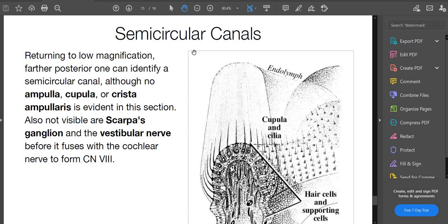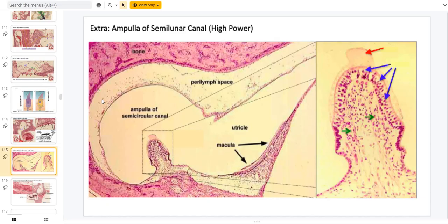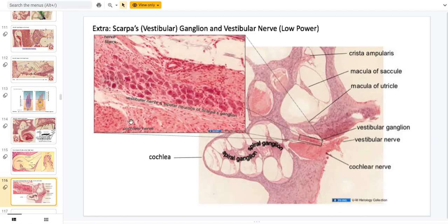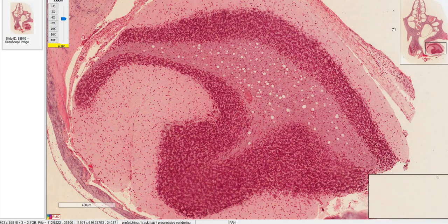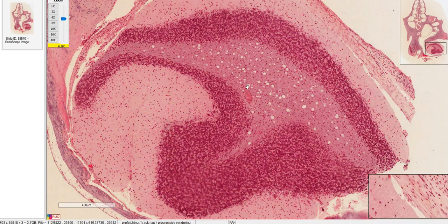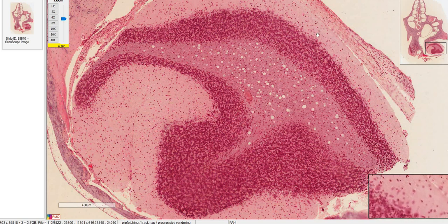There are some other structures the histology lab manual mentions that aren't in our slides, so I won't go into detail — our PowerPoint does cover them with pictures. The one thing I will mention is Scarpa's ganglion. Just like in the cochlea the spiral ganglion sends its axons into the cochlear nerve, the analogous structure for the vestibular system is Scarpa's ganglion, sending its axons into the vestibular nerve. The cochlear nerve and the vestibular nerve combine to make the vestibulocochlear nerve, which is cranial nerve eight. The lab manual also asks about the structure in the bottom right, which appears to be the flocculus of the cerebellum.